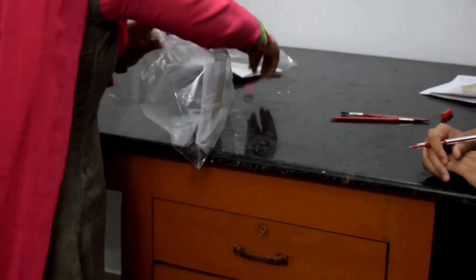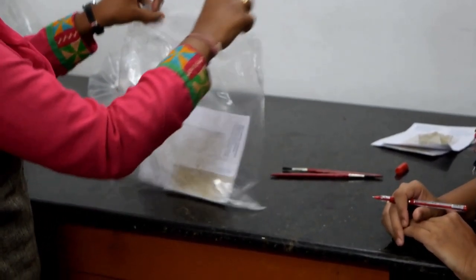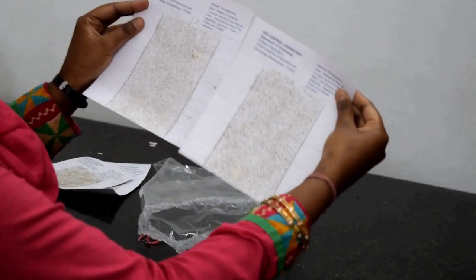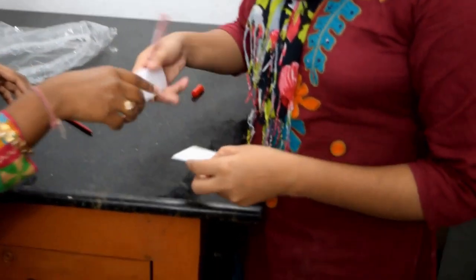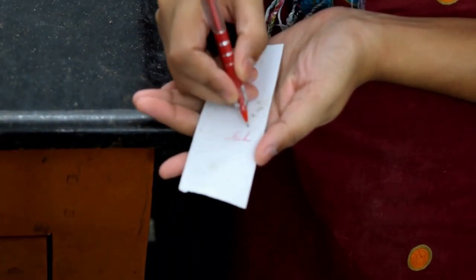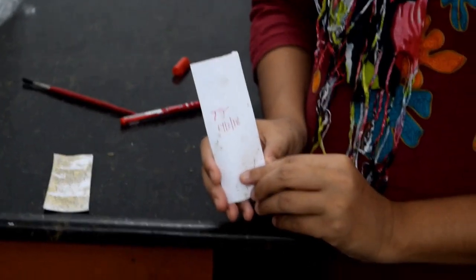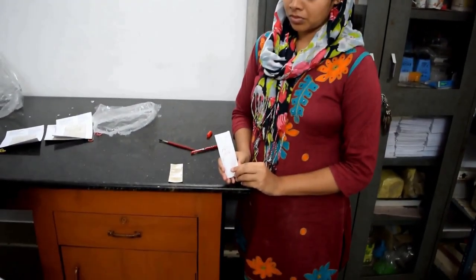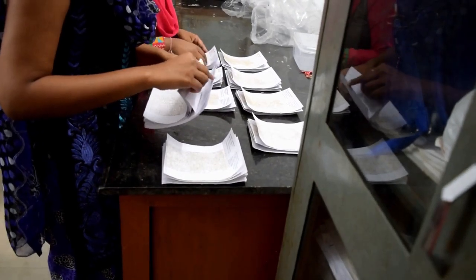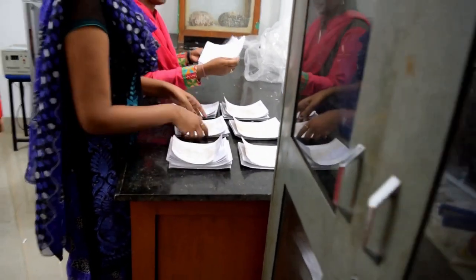Date and species of Trichogramma are written on trichocards and new inoculum cards. The old inoculum cards are discarded. The trichocards and new inoculum cards are packed separately in polythene bags.